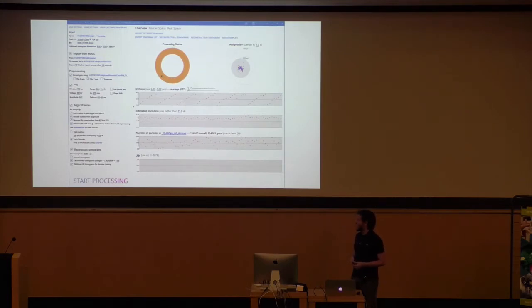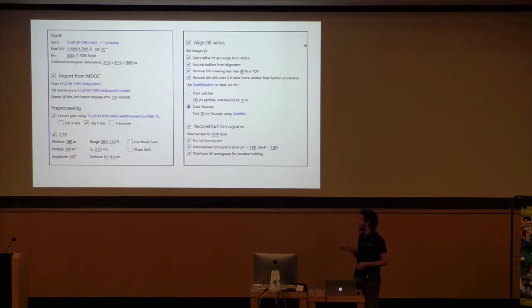So this is still very much work in progress. I haven't cleaned up the GUI as much as I have for the 2D case, so I have to actually split it down 2 columns on this slide so you can see something. The first addition is Warp can now import tilt series information automatically from mdoc files that Serial-EM generates.